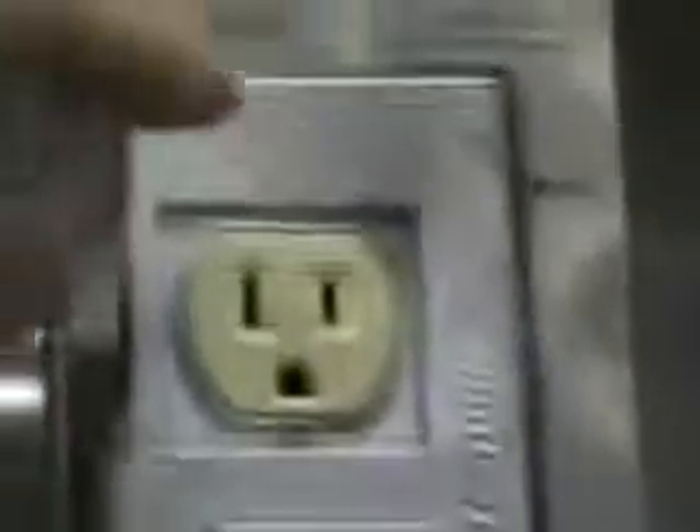External power ports on the outside here. There's a little indentation, a little crush there, a scratch up here, some denting on the sides. Let's get down to the particulars.